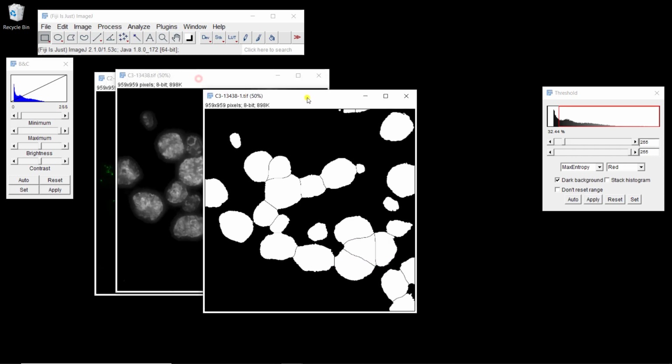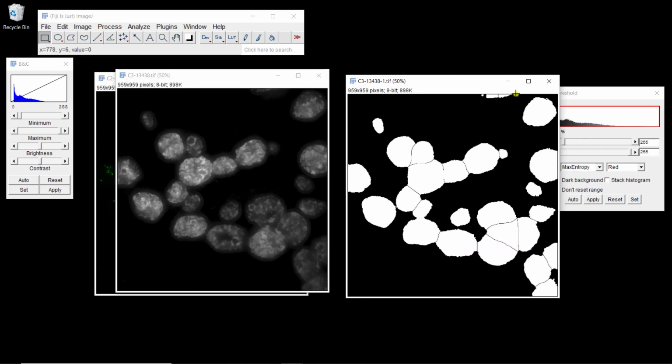And if we compare to the original image, on top we have this partial nucleus, which is really just a small part of a nucleus, and it's not going to be very informative. Here, in a post-processing step, we could just get rid of small structures, and we could get rid of this because this is not going to help in the analysis. Now, if we look at everything else, here nuclei are well separated. Their masks are a bit large, but it doesn't matter because we just want to identify where the RNAs are.